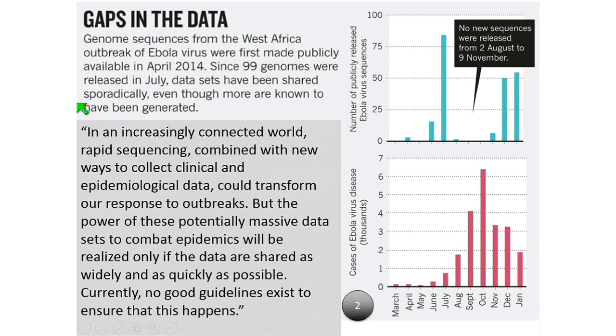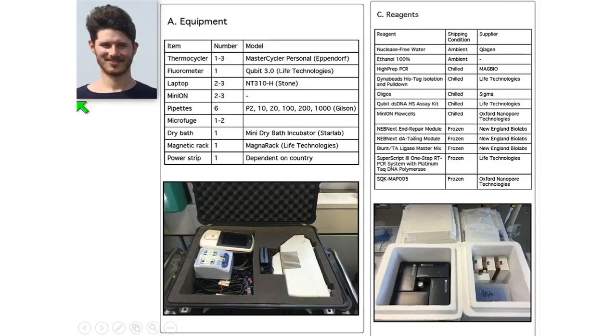For example, it's very hard to get a logistics carrier to take a big package of Ebola-infected blood and send it to your laboratory, and not unreasonably. So DHL, FedEx wanted quite a lot of money to do that. And of course, there are significant ethical and logistical issues with collecting those samples and shipping them out to other labs. And so clearly, our idea was that it would make more sense to move the sequencer to the sample, move it into the heart of the epidemic rather than trying to get samples out.